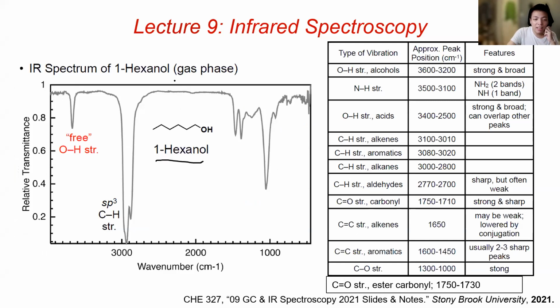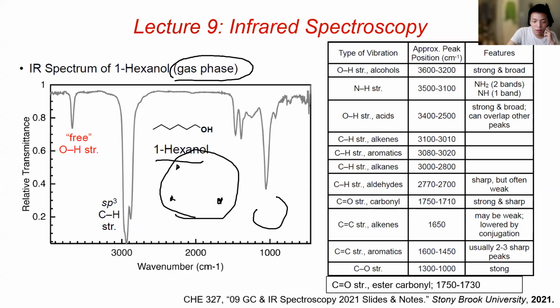First is the alcohol in gas phase. Because the molecules are further apart, instead of sticking close to one another, the alcohol peak for gas would be really sharp.